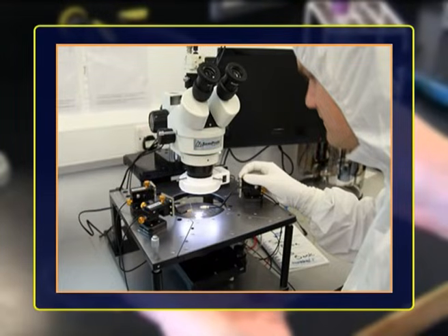The advantages of this method are that one can be reasonably sure that the cultures come from a single cell and one can obtain strains within the species. The disadvantages are that the equipment is expensive, its manipulation is very tedious, and it requires a skilled operator. This is the reason why this method is reserved for use in highly specialized studies.